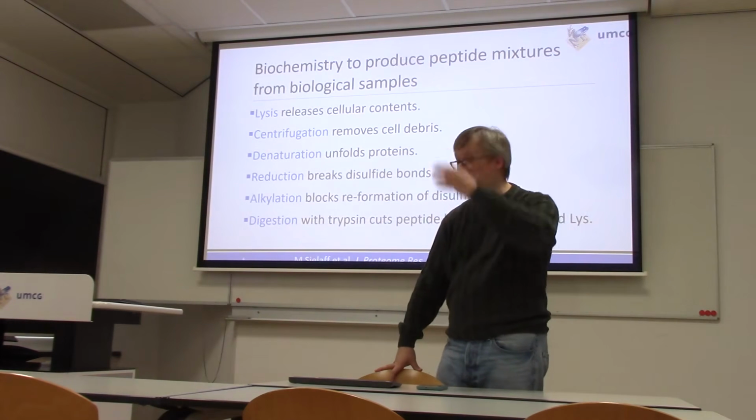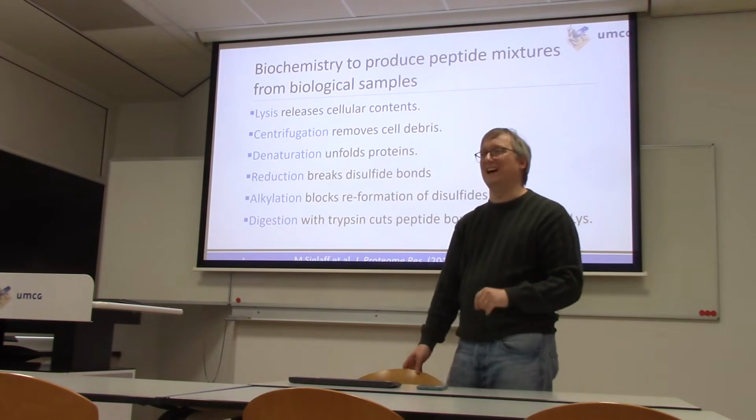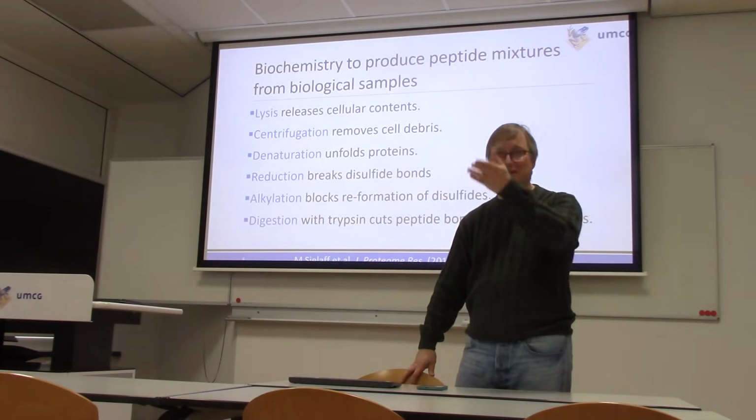Salts? Yes, salts can be very adventuresome. You don't necessarily want to spray those into your mass spec, because what you want is every peptide to be protonated, not bearing a sodium ion. So yes, salts are a problem.